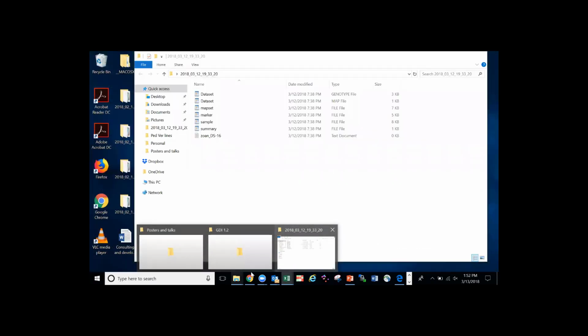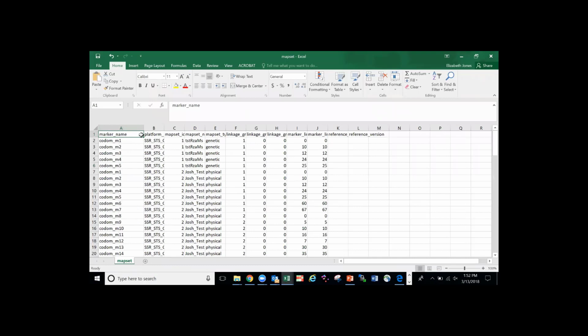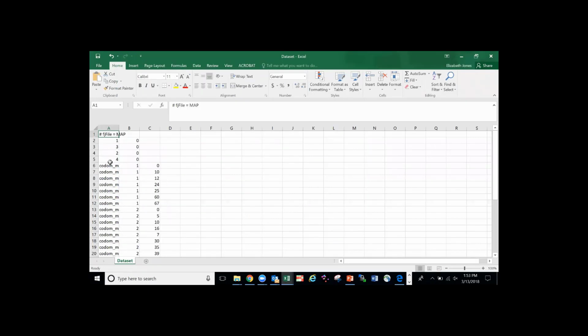And then we need a map. And the map looks like, okay, so, hang on, this is the map set. There's a metadata file that gives you all of the map locations that marker has in the database, so how many different markers it's been mapped to. And then there's also another file that is specifically used for Flapjack. So again, it has the little FJ header at the top.